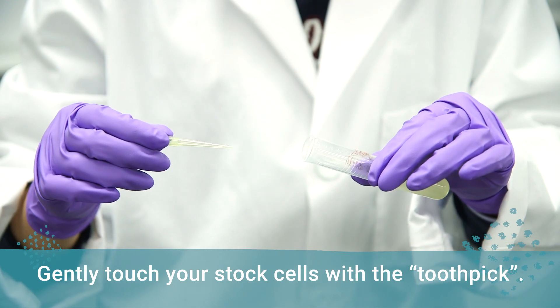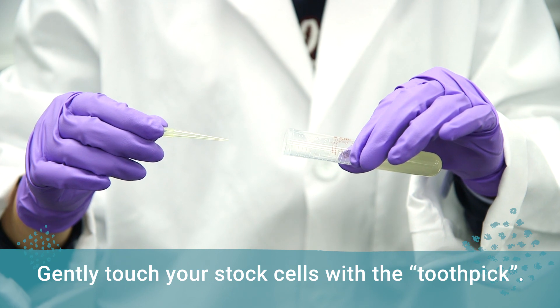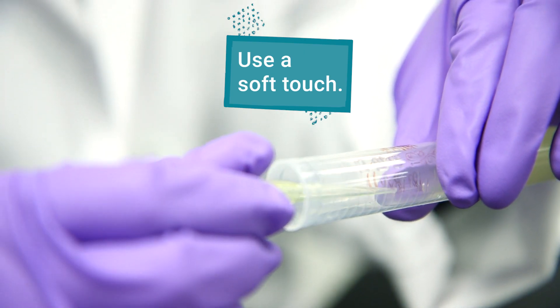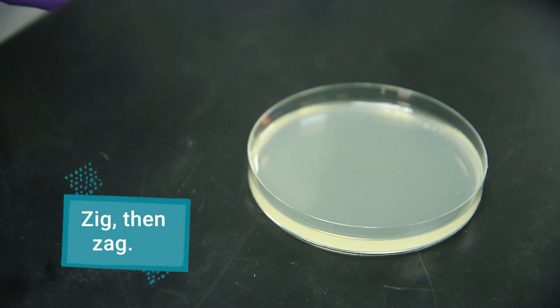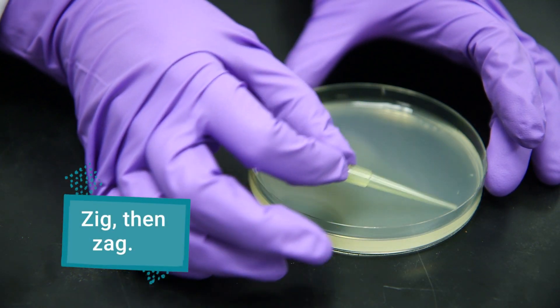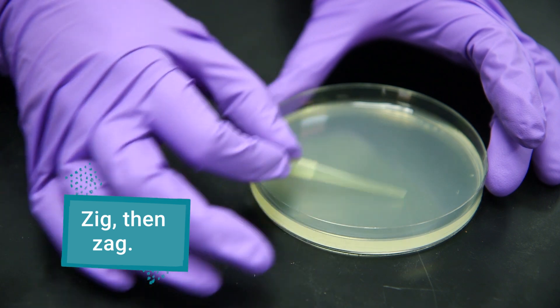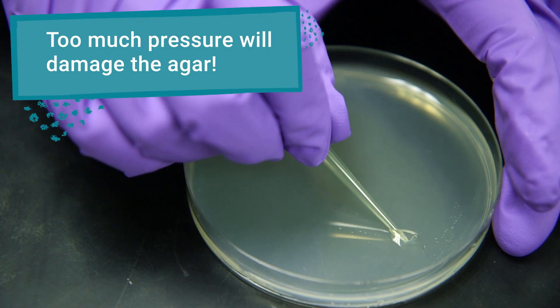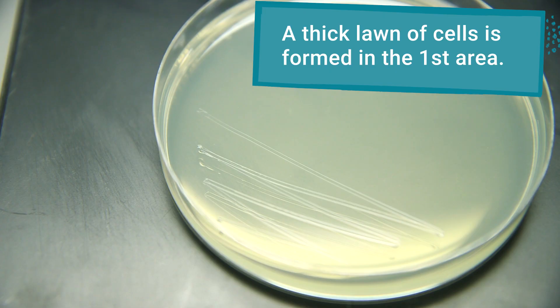Start by gently touching your stock cells with the toothpick. Just a soft touch is enough to get all the cells you'll need. Carefully, using a back-and-forth zigzag motion, spread the cells across one side of the agar. Don't apply too much pressure, or you'll damage the agar. This first area will form a thicker lawn of cells.